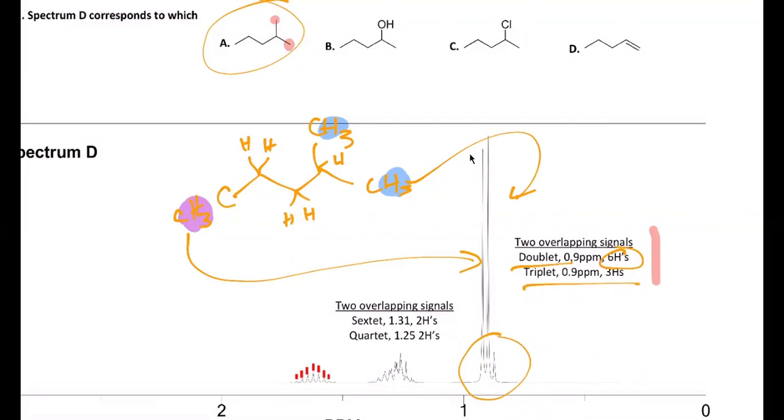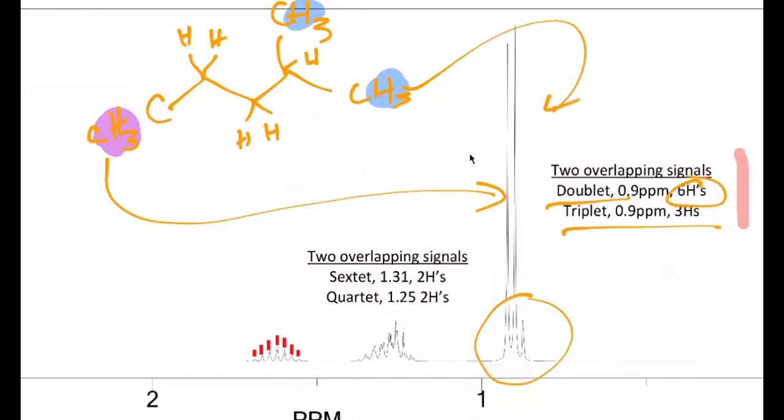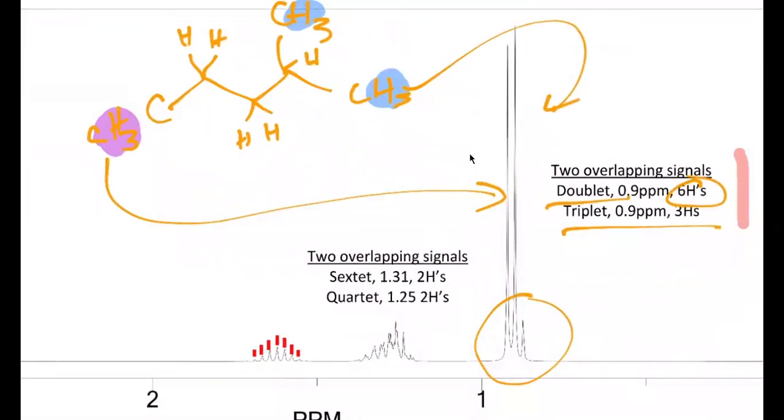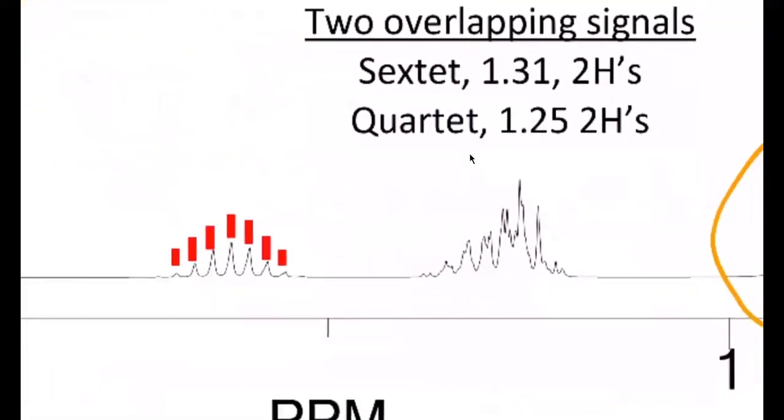And then, what about this proton right here? What do you think? It would be a multiplet, like 7. Okay, will it be 7 or will it be 9? Oh, 9, I didn't double it on the side. If you look right here, I tried to parse it out.